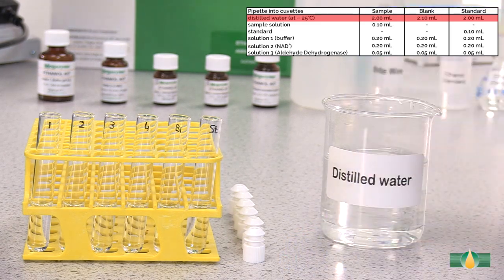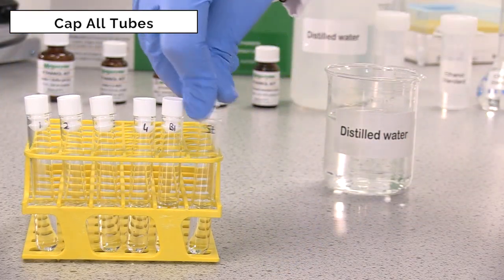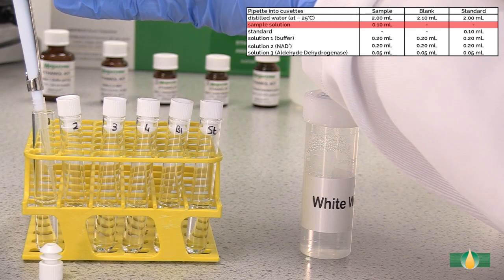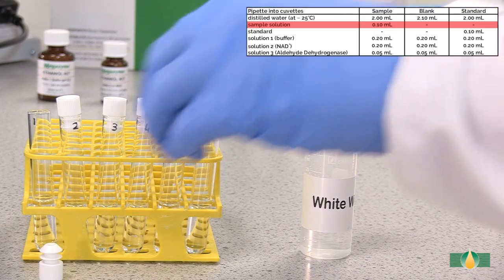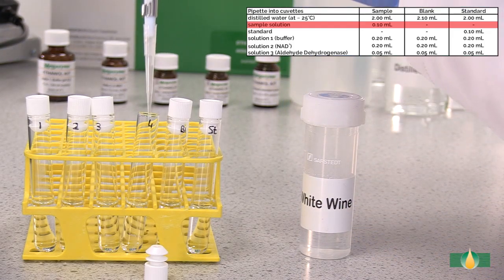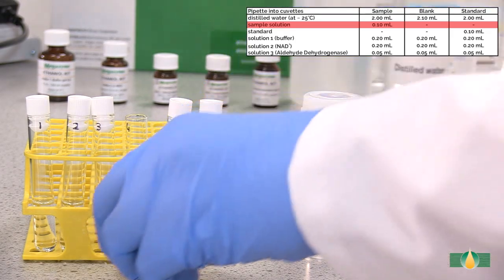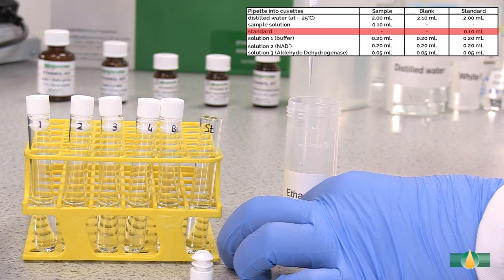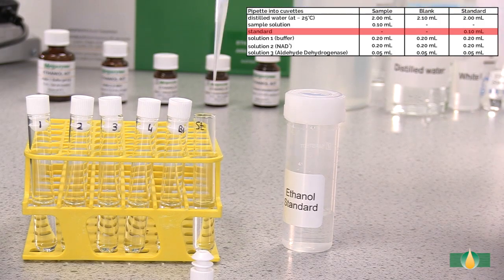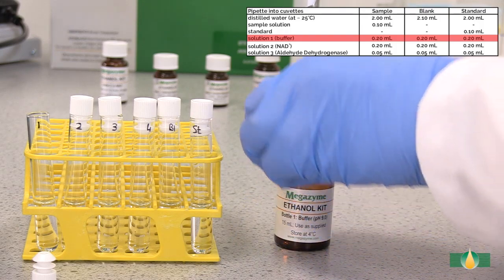Add an additional 0.1 milliliters of distilled water into the blank assay tube. Add 0.1 milliliters of sample to all sample assay tubes. Add 0.1 milliliters of prepared kit standard to the standard assay tube.